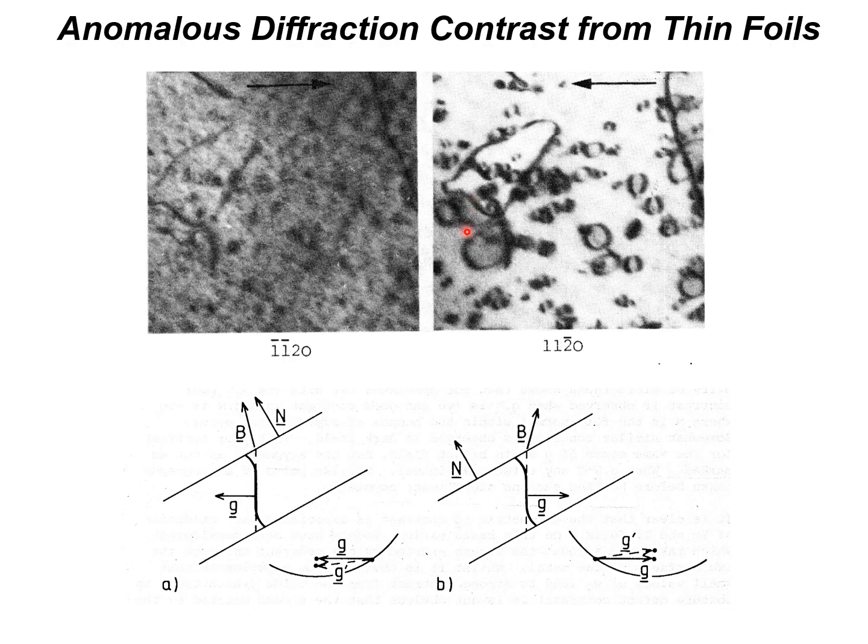In this particular case it's essentially the same plane that's diffracting, and we see, for instance, this dislocation here, but it's very difficult to see where that dislocation is in this case. This loop here, yeah, there's probably something there, but I can't see very much. So the analysis is very ambiguous.